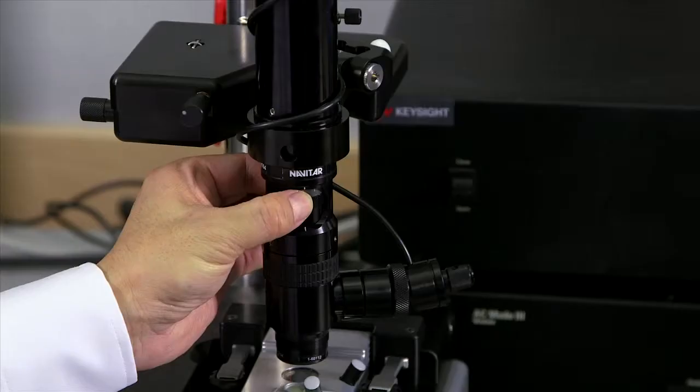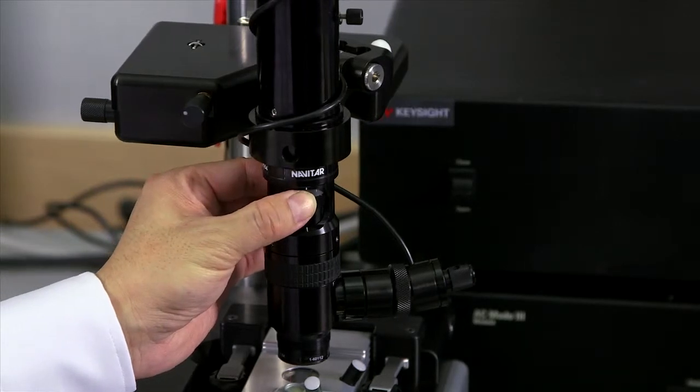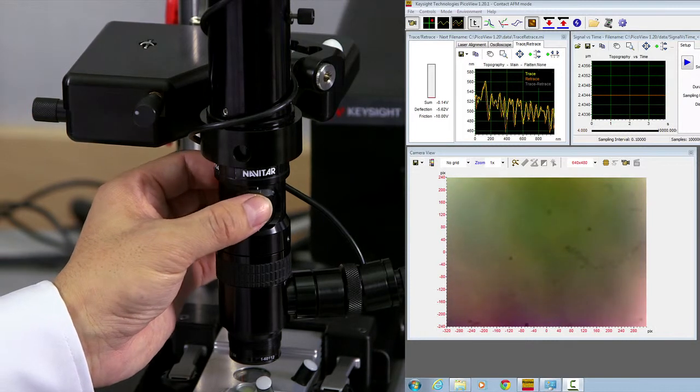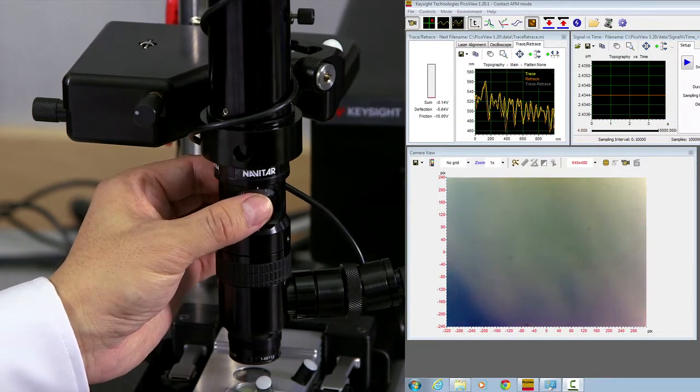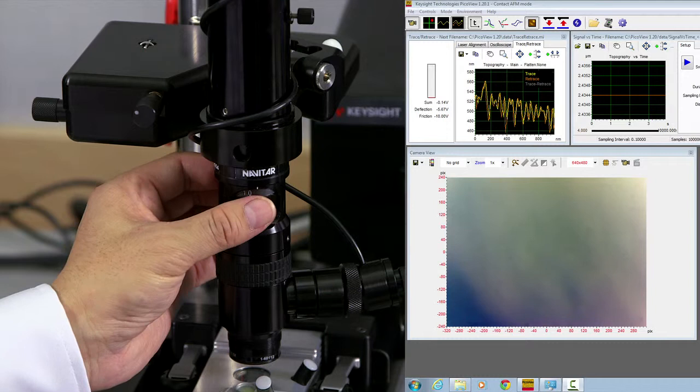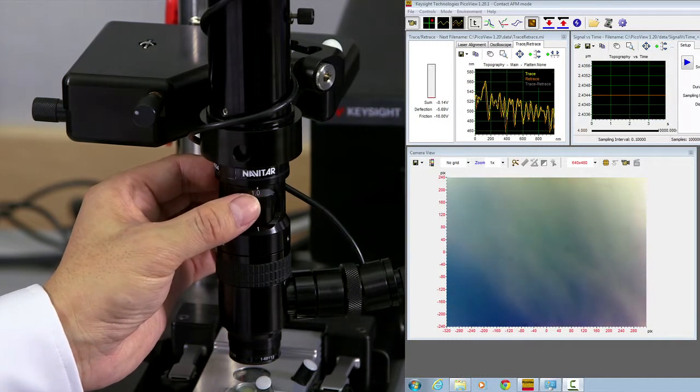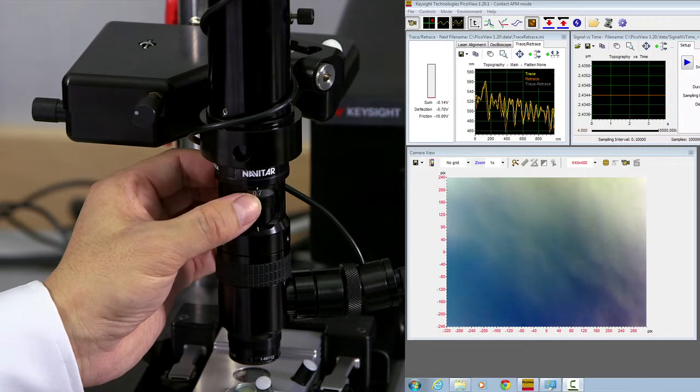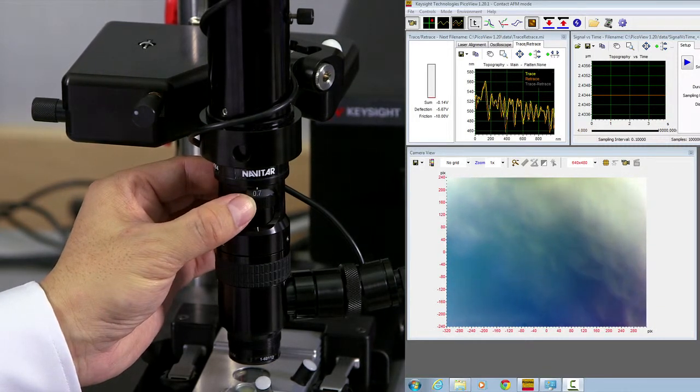You rotate the zoom ring. At the same time, look at the computer screen, look at the optical microscope view. And if you cannot find out which direction is the zoom out, you can look at the brightness of the image. Normally when you zoom out, the image becomes brighter. Zoom all the way out to its stop position.